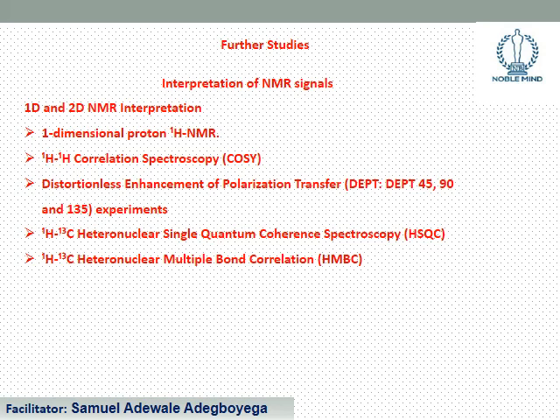and in fact, that is when you can truly understand the interpretation of NMR signals. So that's important for you. It's important for you to do further studies in order to actually understand fully what NMR is and to be able to use the spectroscopic method in structural elucidation.